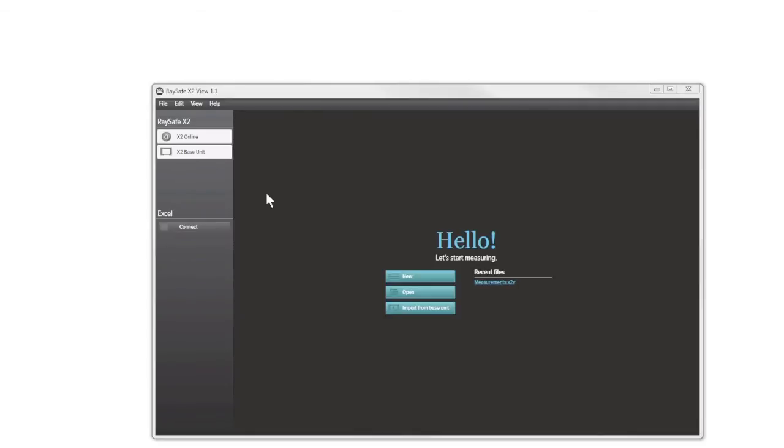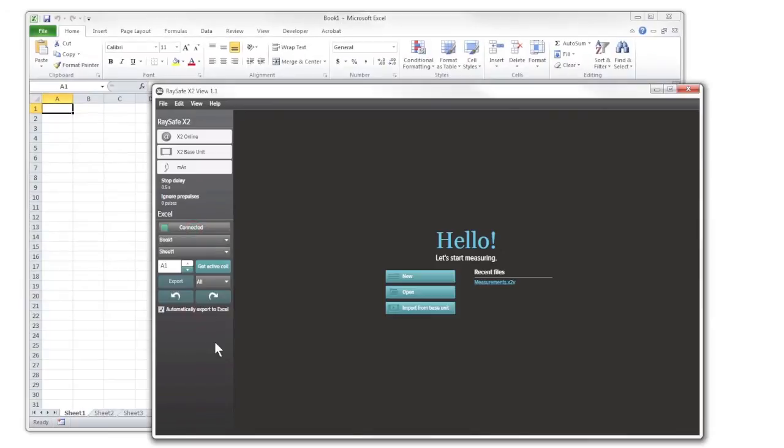Here is our base unit. Connect a sensor. Then press connect to start Excel. Make sure that automatically export to Excel is checked.